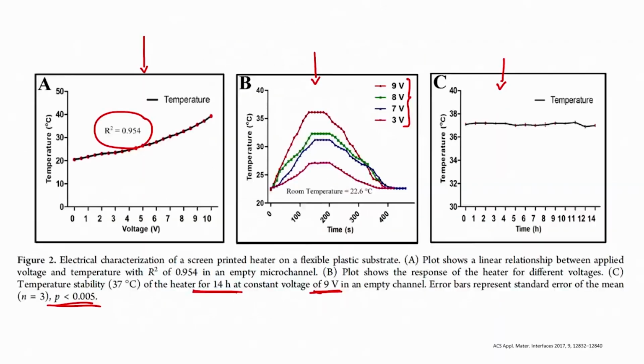But like I said, if you want to test multiple antibiotics, you need to have a microfluidic technology.